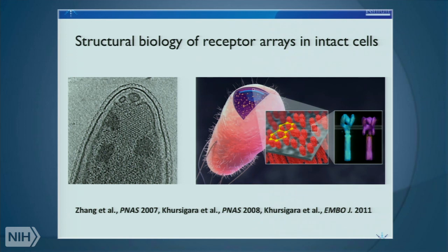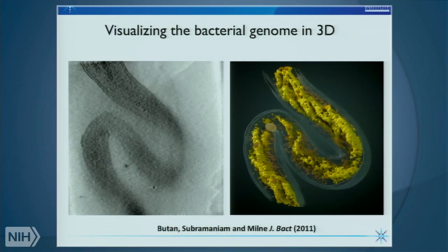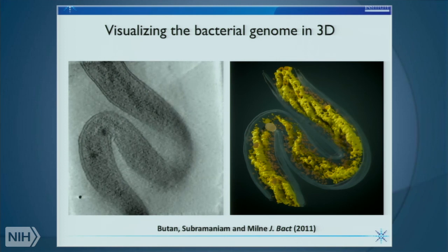And many years ago, a decade ago or so, these were the very first efforts to determine structures of membrane proteins in situ, where we could actually add ligands and look at changes in the organization of the assembly and individual protein structures. But all of this was at relatively low resolution, but it had the value that it let us take on, at that time, a considerably more challenging problem, which was to look at these whole cells and look at all the other pieces in it.